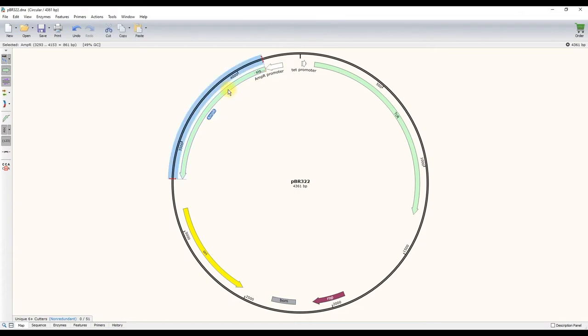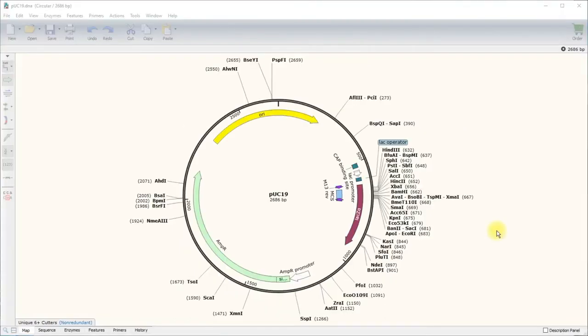Next, shown in green, are two different antibiotic resistance genes, ampicillin and tetracycline, each with its associated promoter. Expression of the proteins encoded by either of these genes protect bacteria, which contain this plasmid. Normal bacteria, when exposed to ampicillin or tetracycline, die. If the bacteria contain intact pBR322, they will survive. Selectable markers are found on all plasmids. Numerous functional elements have been added to plasmids over the years.